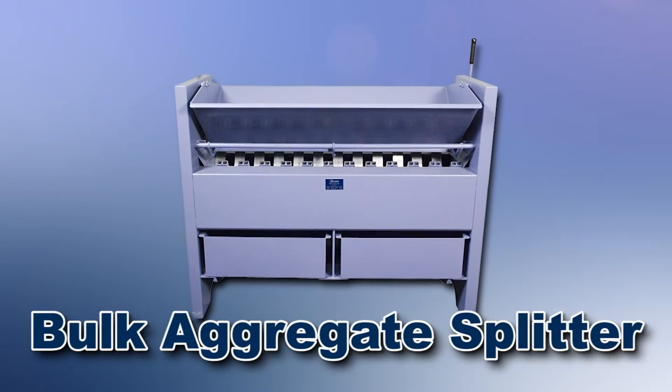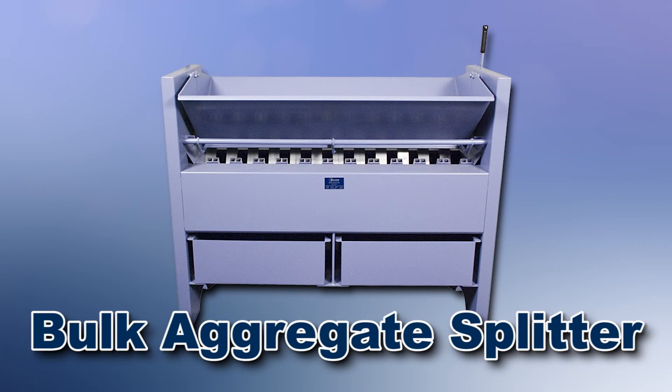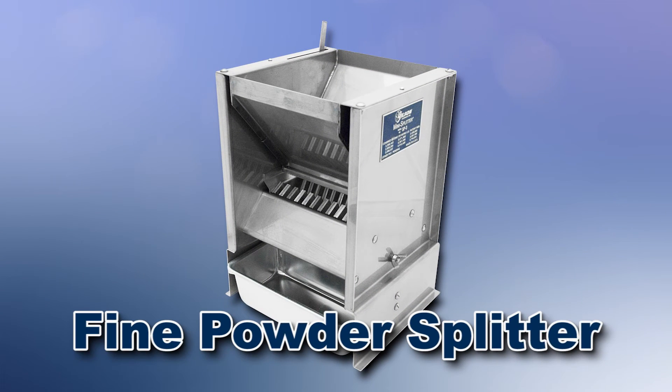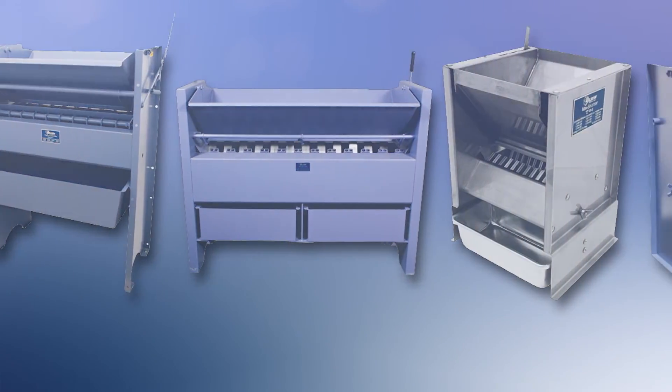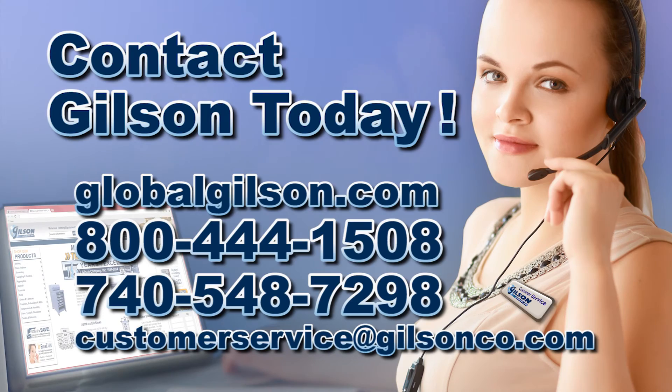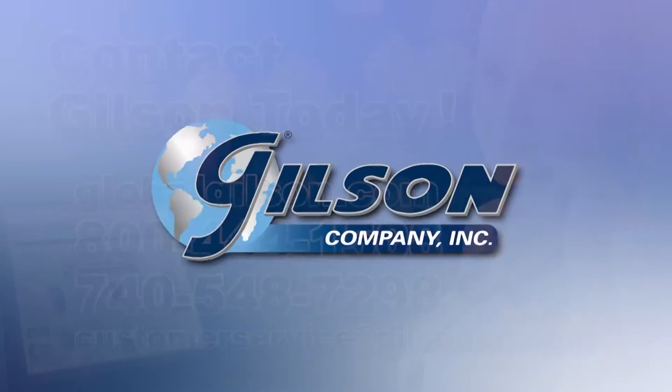From the Gilson SP-0 mass splitter for large volume bulk aggregate samples, to the SP-33 all stainless steel mini splitter for fine powders, Gilson has the right equipment for your representative sampling needs. Be sure to check out these and all our other sampling products in the Gilson catalog and on the Gilson website. Gilson — your industry leader in material testing equipment.